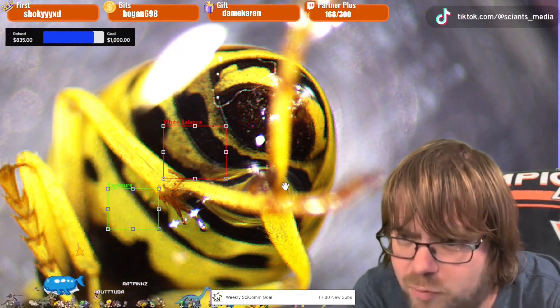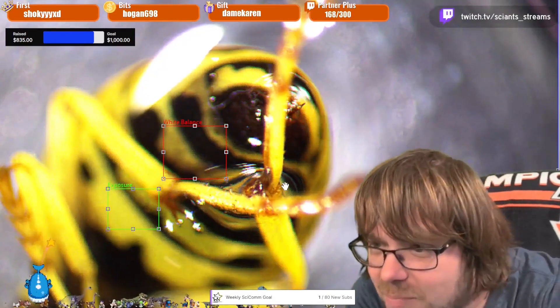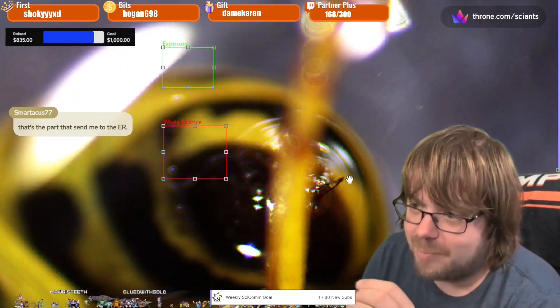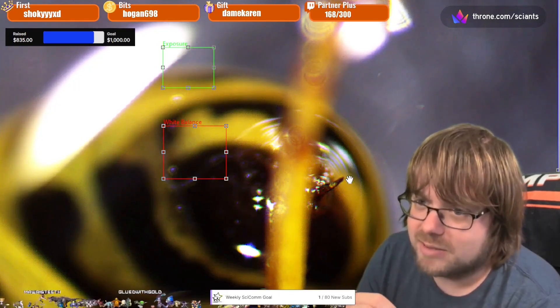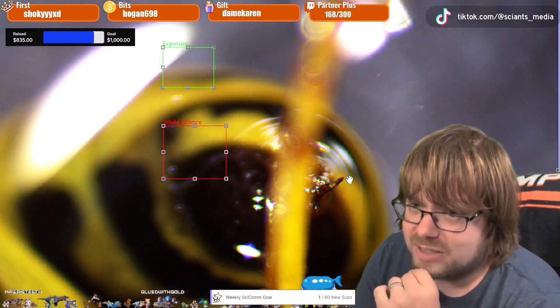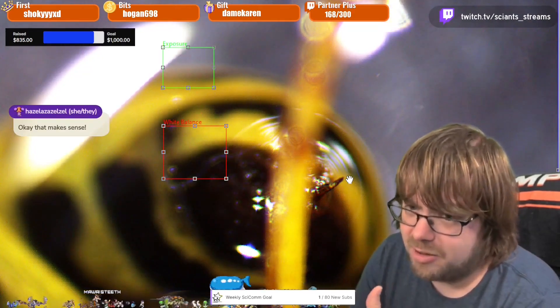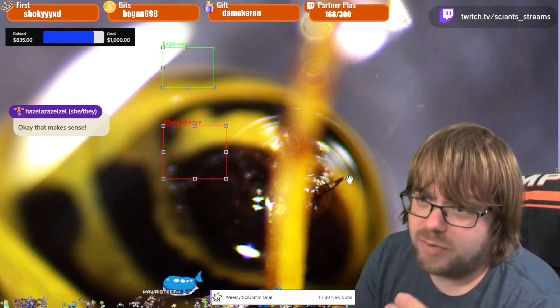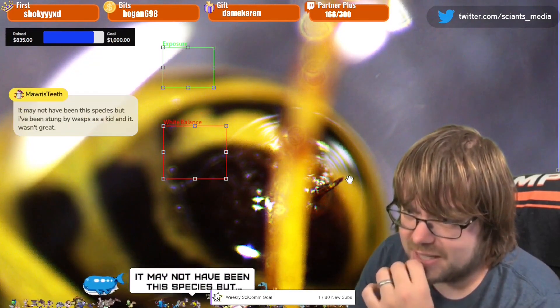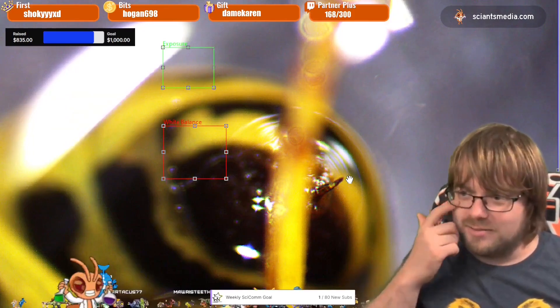Before we start moving her around, I'll probably just pop the abdomen off to get a closer look at the stinger. You can kind of see it there - that is the stinger. The painful part isn't the needle because it's almost like a hypodermic needle; it's the venom that goes in. There are different wasp species that have different flavors of venom - some cause cell death, others cause immune suppression. This has been preserved in alcohol, which means when we dissect it open we'll find the venom gland, but that venom is deactivated because of the alcohol, so we'll be safe.